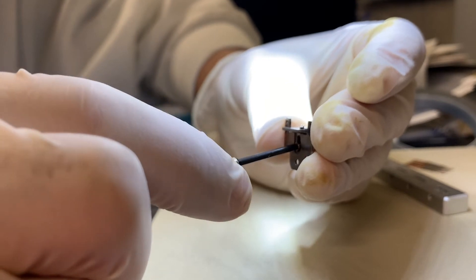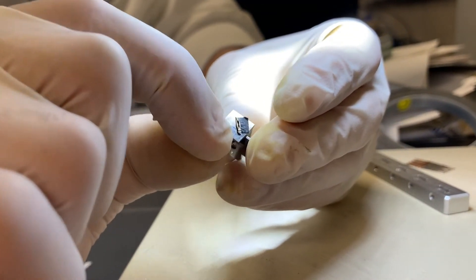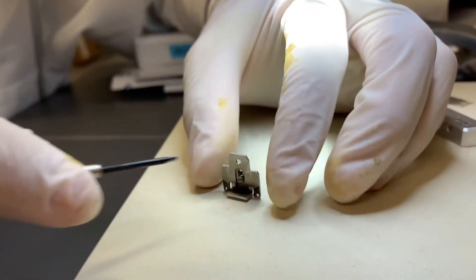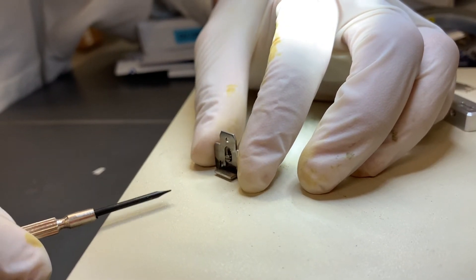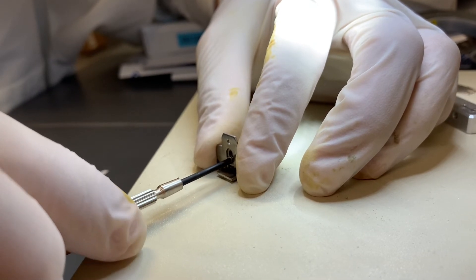Loosen this screw so the sample stage can move, and put the sample holder down to the stage. Then tighten the screw.